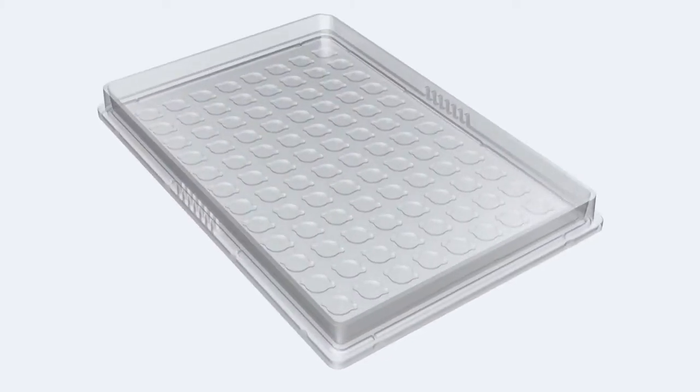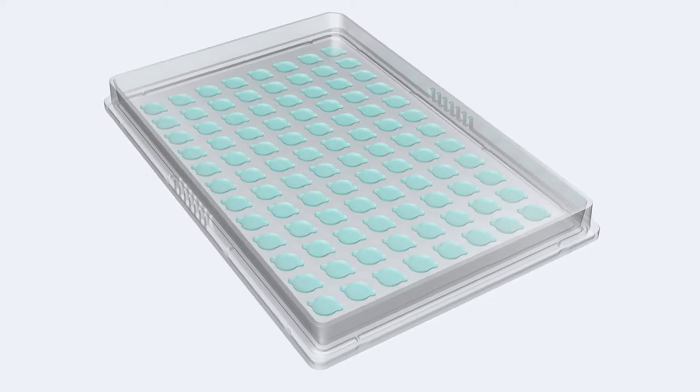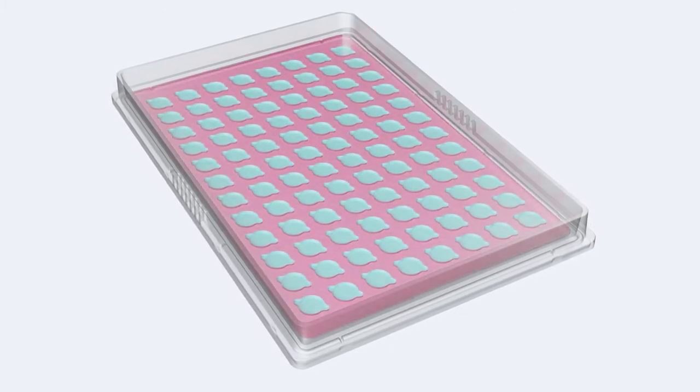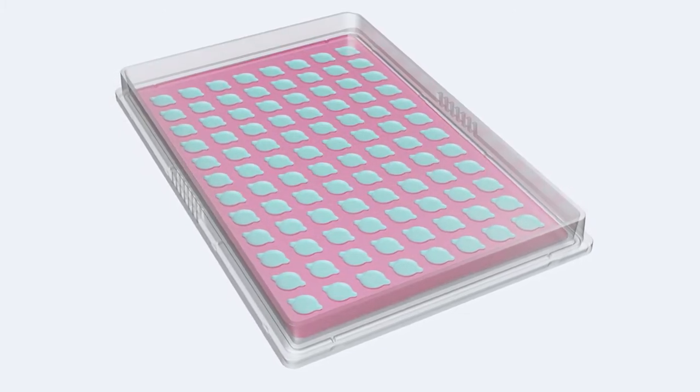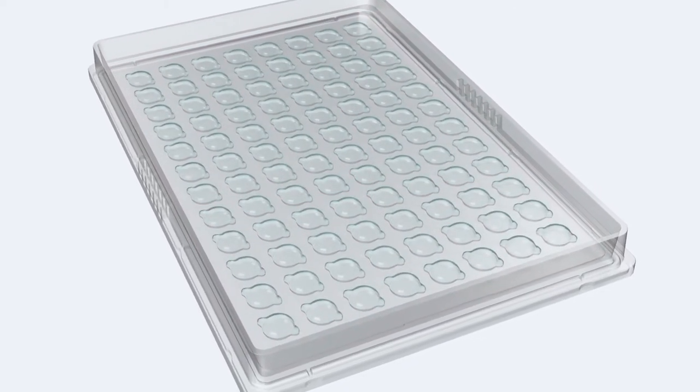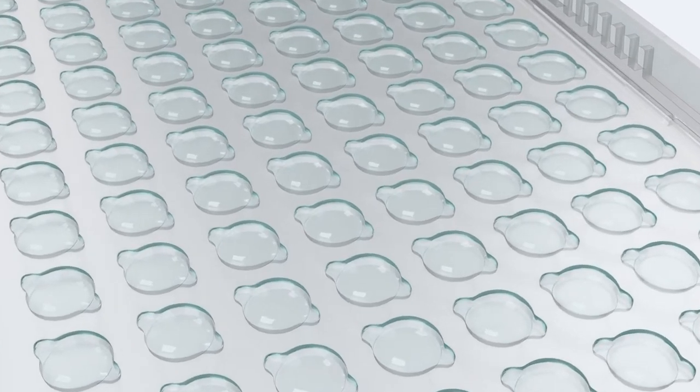Wells on the laminar wash plate have a hydrophilic surface inside low-profile walls, including two smaller satellite areas, and are separated by a proprietary hydrophobic surface. These uniquely engineered plates maintain each sample in a separate droplet, held in place by surface tension and hydrophobic interactions with the surrounding material.